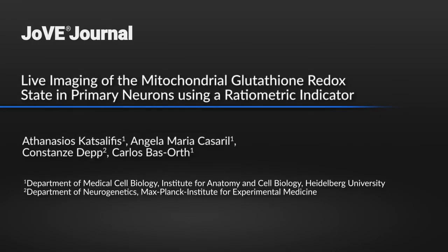This method allows investigation of how mitochondrial redox state is affected in pathophysiological conditions. It can also be used to assess the efficacy of treatment strategies that aim at protecting mitochondria. The main advantage of this technique is that it allows an organelle-specific assessment of dynamic and tracing changes of mitochondrial redox state in real time.